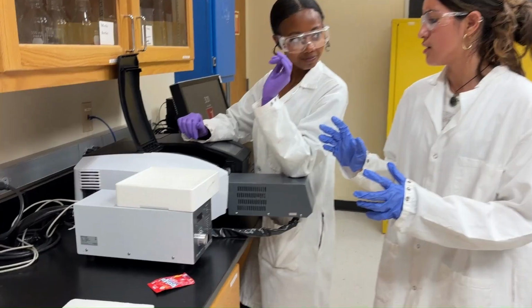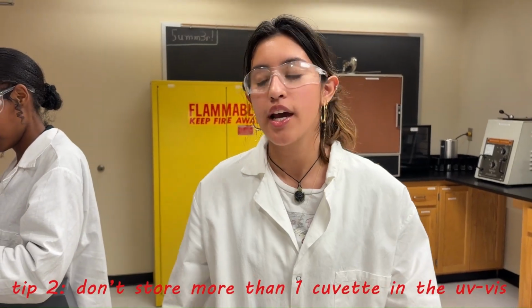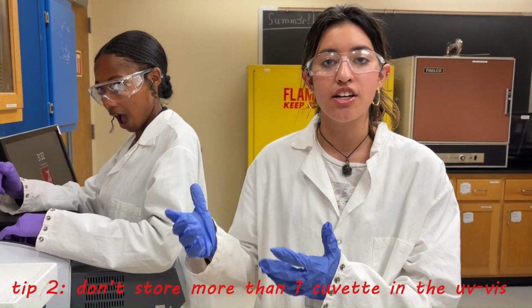Whoa, hold on a second. What are you doing here? This is something you do not want to do. Having multiple cuvettes in there can cause errors in our calibration curve. You only want to do one at a time.